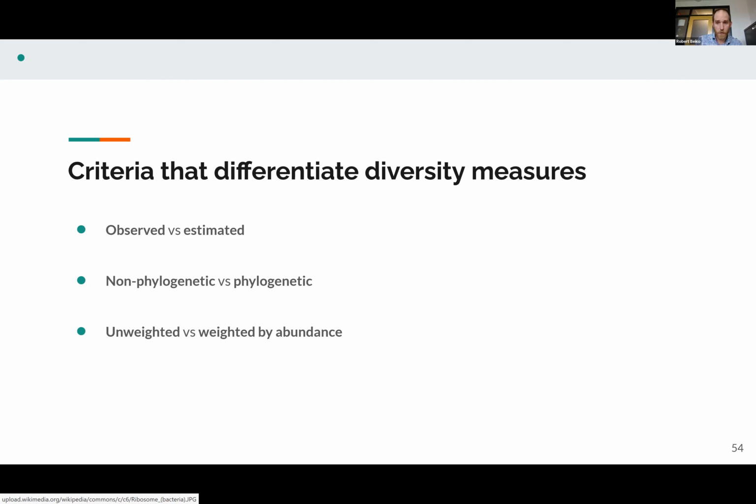Which is more diverse? Well, if you're using a non-phylogenetic method, then if you're defining your things in a certain way, they're equally diverse. But a phylogenetic method will say, whoa, no, no. Look at the branch lengths. The Salmonella are really similar to each other, whereas there's this obnoxiously long branch length connecting the archaeon with Salmonella. Very important distinction.